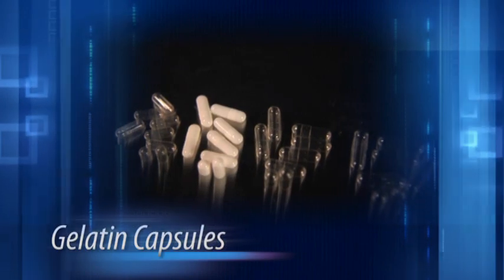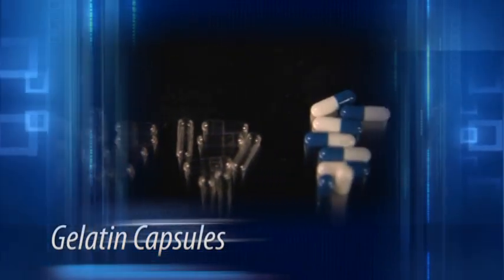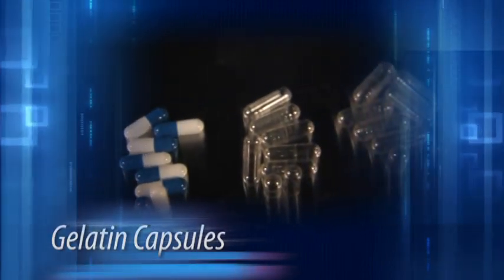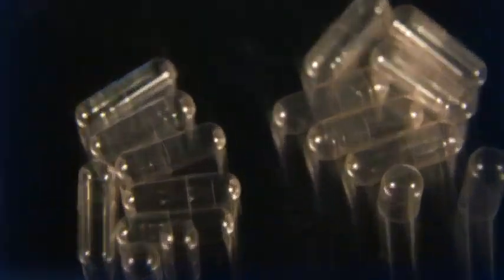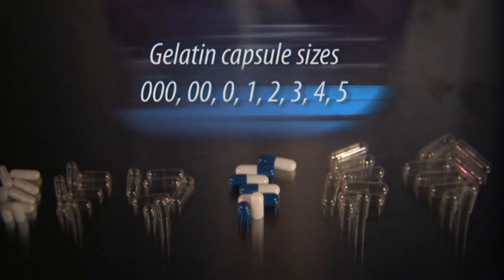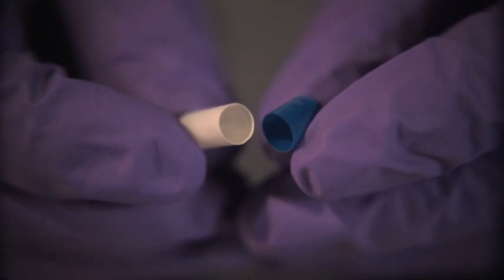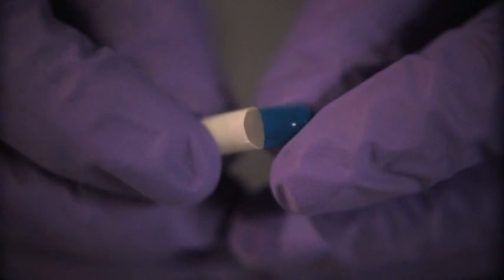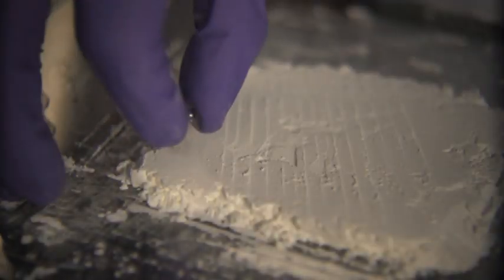As we discussed earlier, gelatin capsules are considered solid dosage forms when filled with liquids, powders, or granules and taken orally. The capsule shells are considered compounding equipment until they are filled with these preparations. Gelatin capsules come in a variety of sizes to best fit the needs of the prescription. The capsule's gelatin shells are composed of two parts, the body and the cap. These two parts fit snugly into one another and are filled using the punch method.